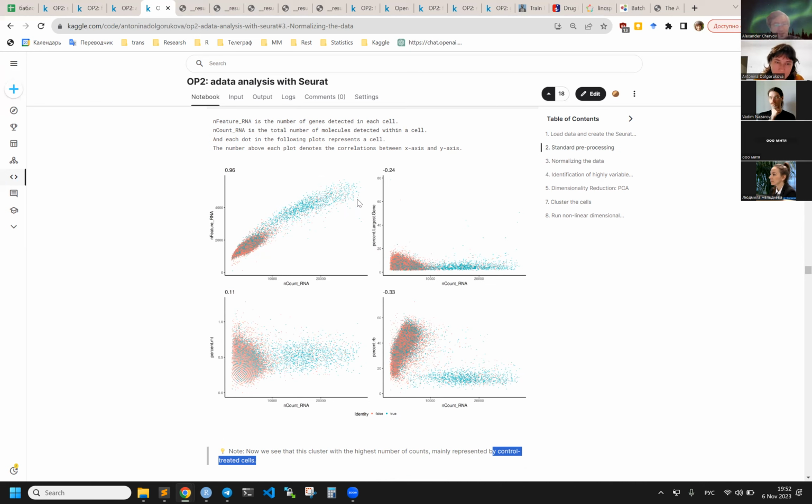The sense is opposite: the drugs from the positive control should have a very strong effect, they should almost kill the cells, but the negative control should ideally do nothing. If I had done so, we could already answer some questions, but maybe I partially answer it below in another way.